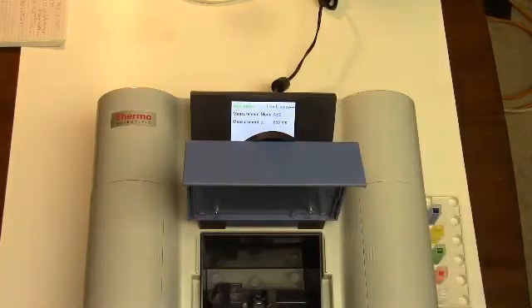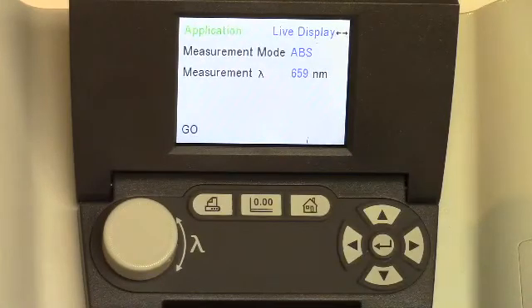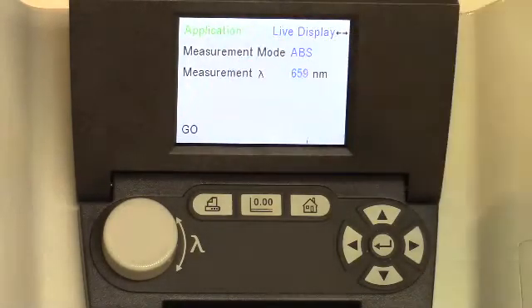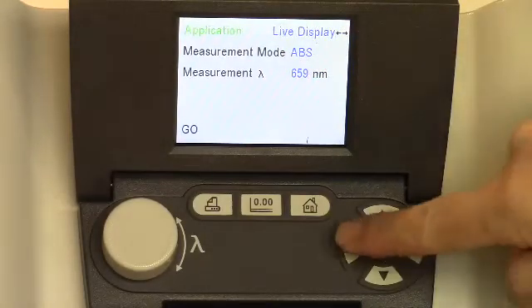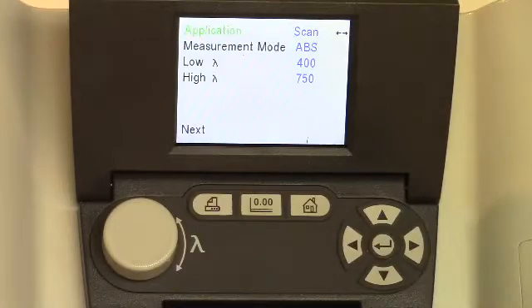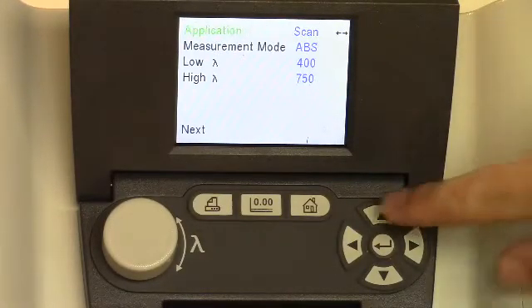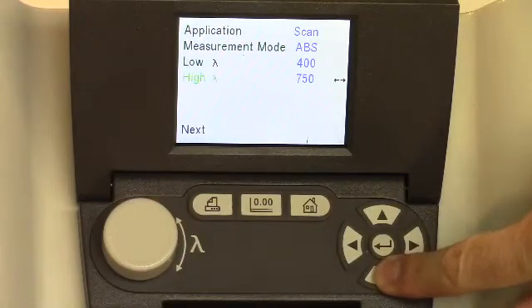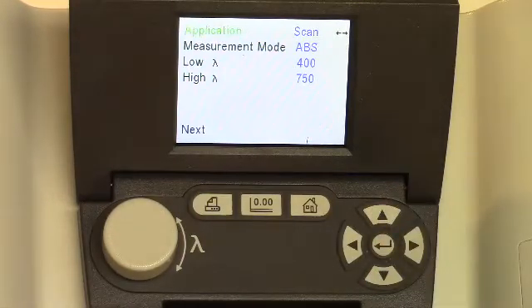Let me zoom in a little bit here so you can see a little bit better what's going on on the screen. So there you'll see the screen. Right now if I hit enter, it'll take us to the live display. We want to actually do the scan function, and I've got it set to go between 400 and 750 nanometers, and you can cycle through all of these different things just by pushing the up and down arrow. So it's a very simple instrument to use.